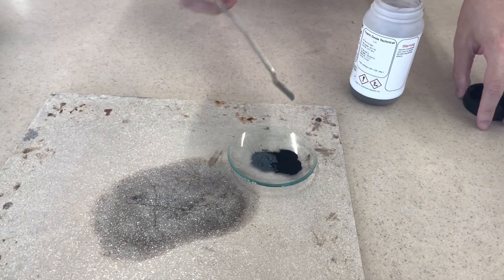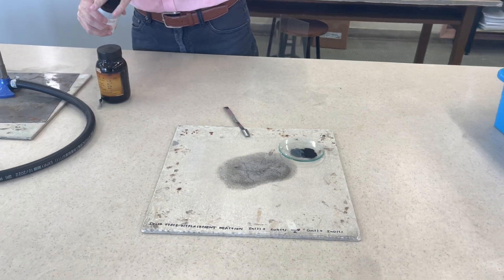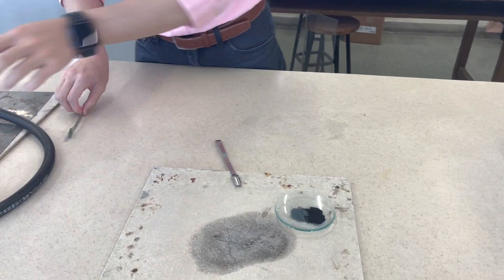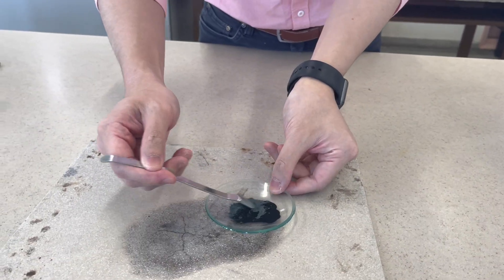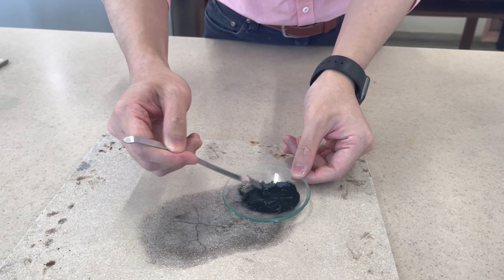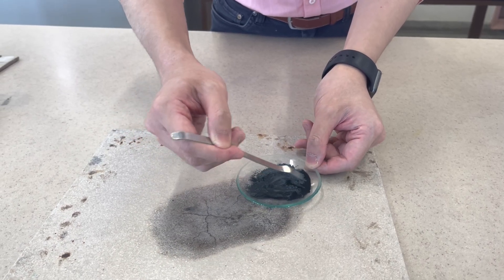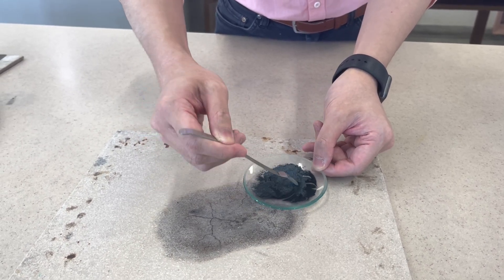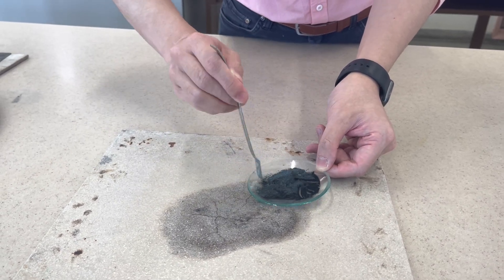This is the copper(II) oxide, and right now I'm going to mix these together. They are becoming a mixture — and note that a mixture is different from a compound. Right now they are physically mixed together.